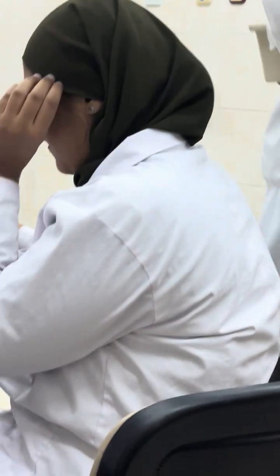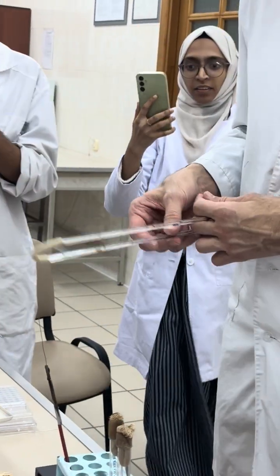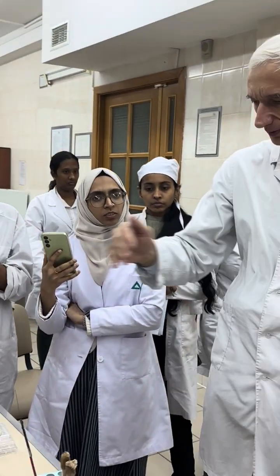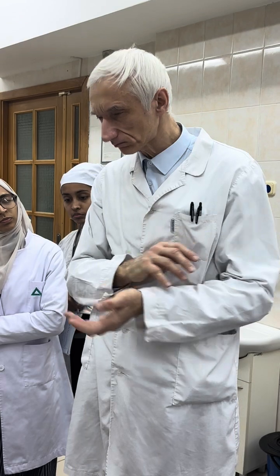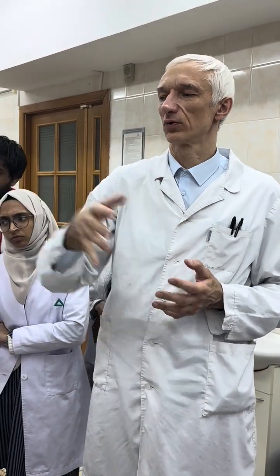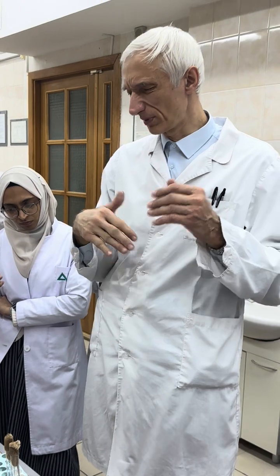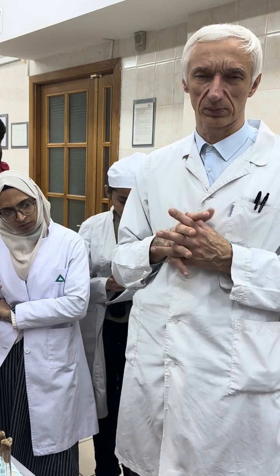Honestly speaking, I have no great time to pay attention to your stain. Simply, I hope the dyes are over there. Slides will be upon the rack. Usually, as I said, 2 persons will do slides in parallel. Gram stain, I usually ask like this: you explain to me what the steps of gram stain are, and I allow you to do it without my observation, because it is a multi-step procedure, very difficult to control all small details. So you are doing it, show me the final result.